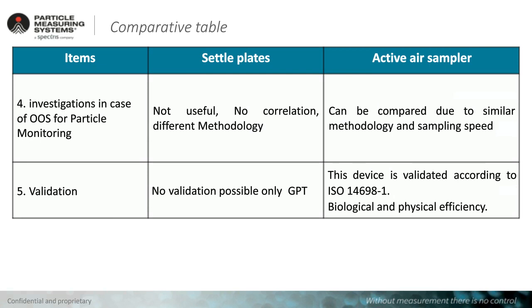The last point, which is, I would say, the most important point after all, is the fact that validation of settle plates is almost impossible. The only thing you can do is a growth promotion test that shows that microorganisms would have grown on the surface.